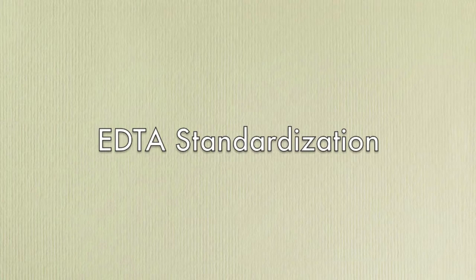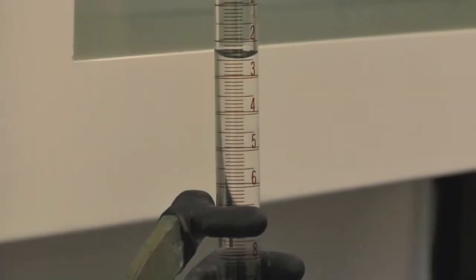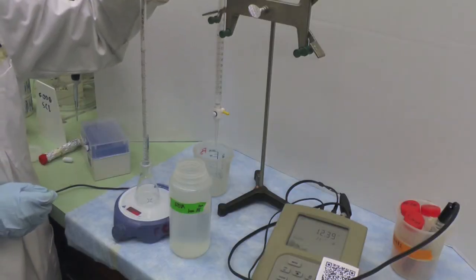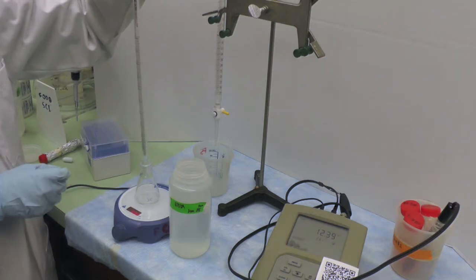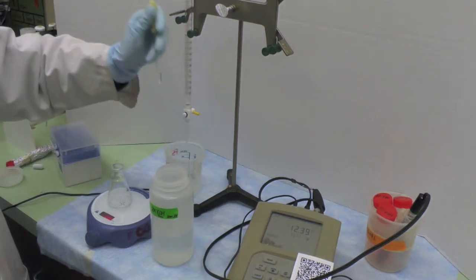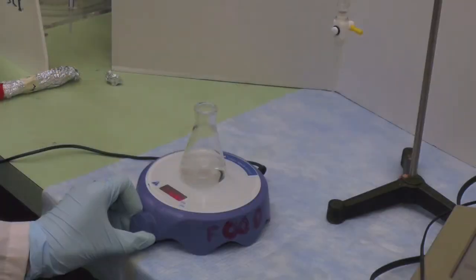To standardize the EDTA solution, fill the burette with calcium chloride standard solution. Record the initial volume. Pipette 5.00 ml of the EDTA solution into a 50 ml Erlenmeyer flask. Then add around 15 drops of potassium hydroxide solution until the pH reading reaches 12 to 12.5 while stirring.